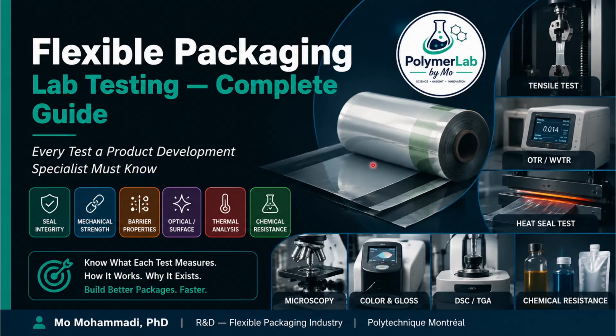I'm Mo. I have a PhD in polymer science and I work in product development for a flexible packaging manufacturer. Everything in this video comes from tests we run in an actual packaging lab. Today I'm going to take you through every major category of flexible packaging lab testing: seal integrity, mechanical strength, barrier properties, optical and surface properties, thermal analysis, chemical resistance, and show you what each test measures, how it works, and why it exists. This is the most complete guide to flexible packaging lab testing you will find. Let us start from the foundation.